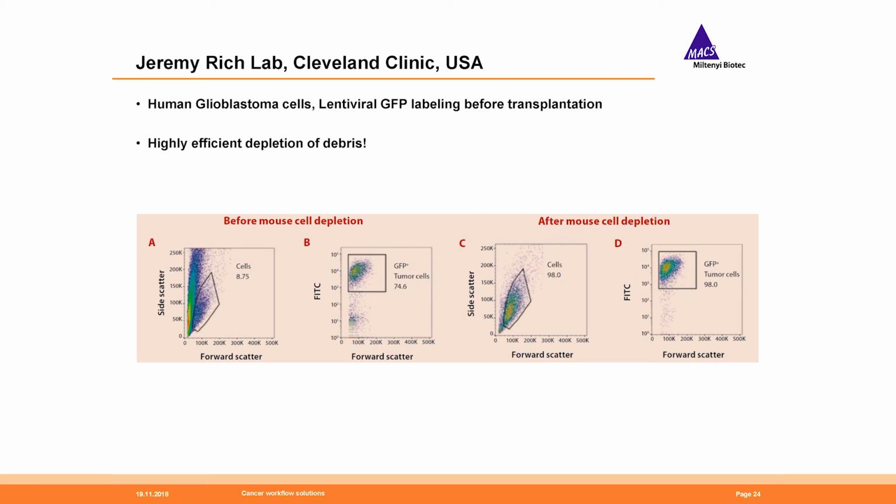So not only are you purifying your tumor cells, which you want to work with, but you're also at the same time getting rid of everything that you're not interested in, such as debris, which might otherwise be clogging up your instrument downstream.